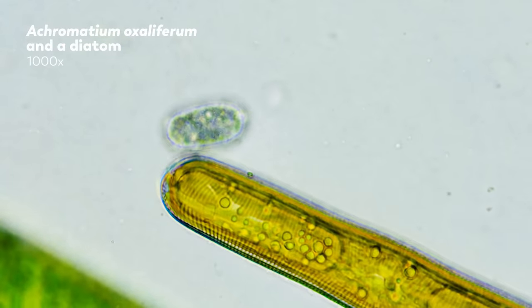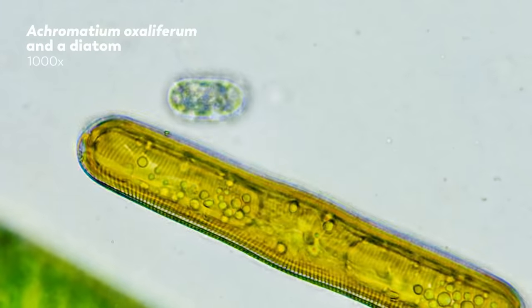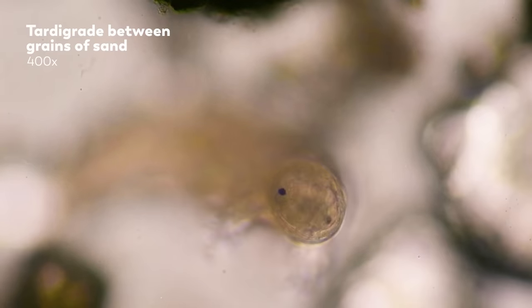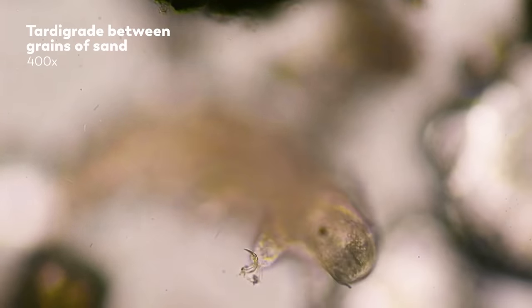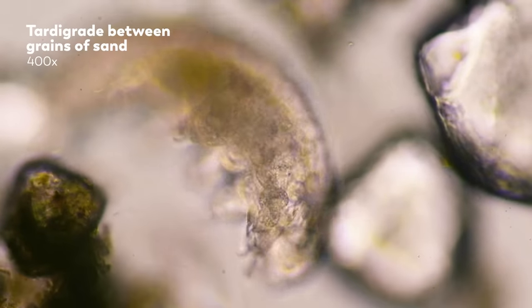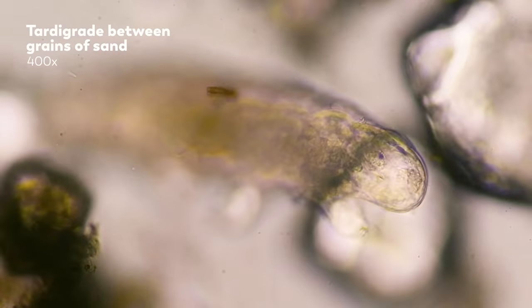Sometimes we actually make that area thicker for larger organisms by putting some stuff under the cover slip — maybe it's some decaying plant matter or some tiny grains of sand. In those cases, however, it becomes easier for those organisms to wander out of focus.